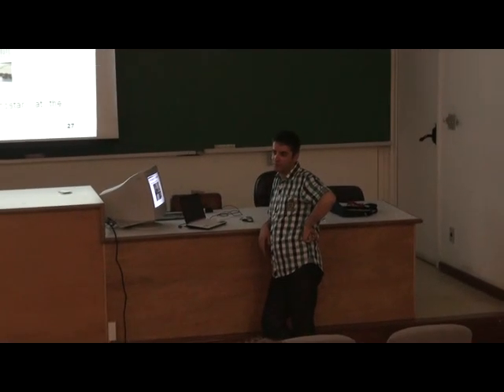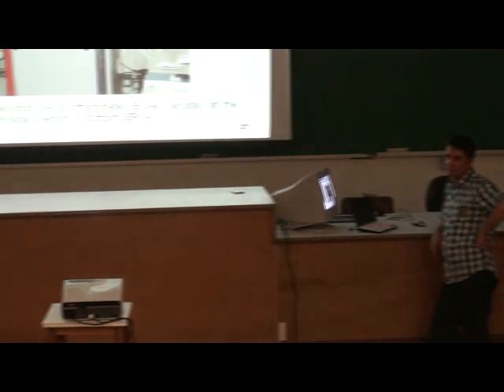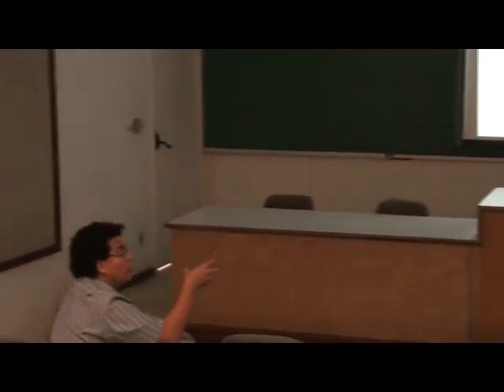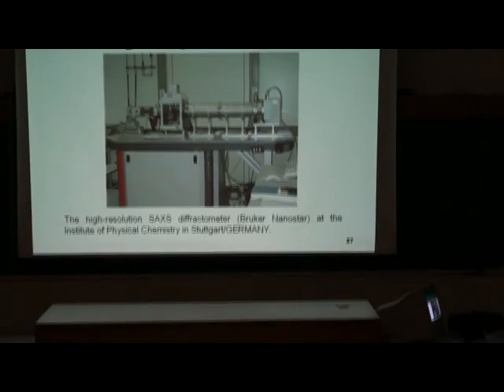This machine, Professor Jens Christian from Denmark bought it like this, and then he made some calculations and optimized this front end to get the beamline design that was later incorporated by Bruker in the new machines. So that's the answer. Okay. I think you're mentioning the new version. Yeah, the new version.